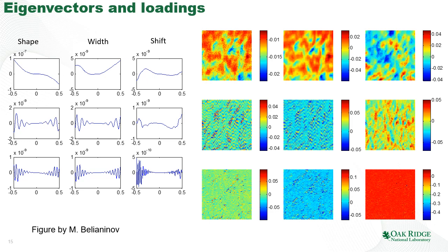So this gives us the initial idea of what the principal component analysis is good for and what it is not good for. It's a great way to explore the data. It's a great way to denoise the data. It turns out that it allows us to decouple the 60-cycle noise or more complex noises remarkably well. We can just use the components that don't have noise to resynthesize the signal.